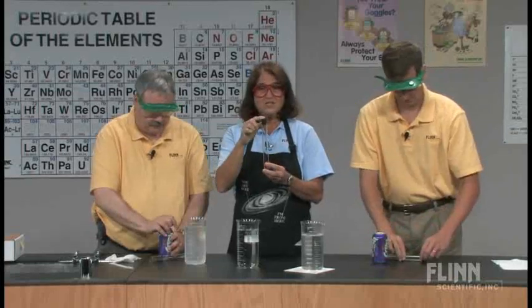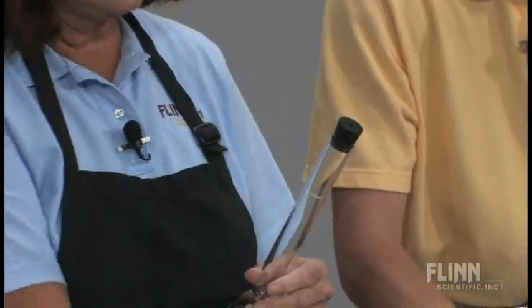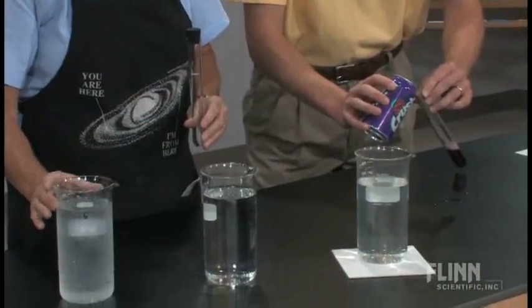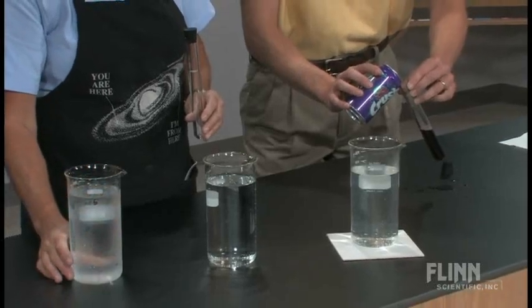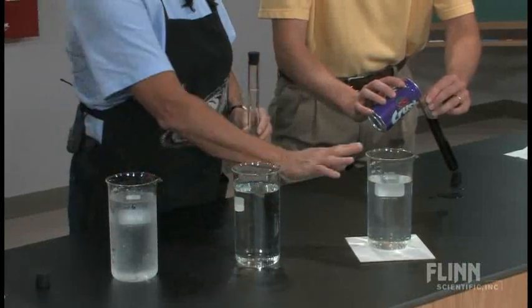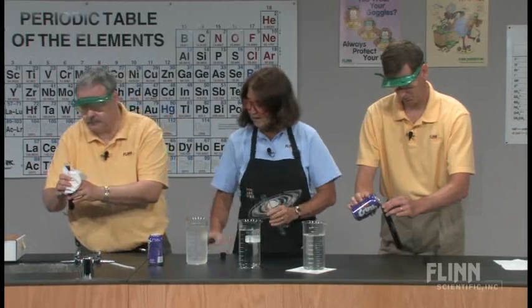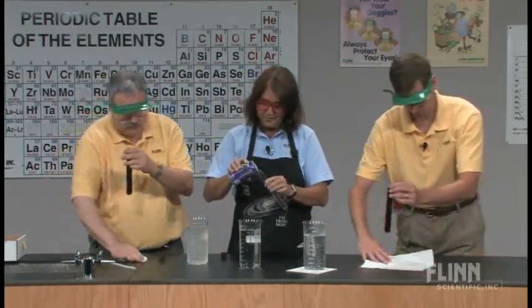We have identical test tubes with a one-hole stopper and three beakers containing water at different temperatures. Jeff has a beaker of cold water — it's about zero degrees, with a small amount of ice still in it. I have room temperature water, about 27 degrees, and Mike has the hot water. We're simply going to fill our test tubes up with the soda without spilling.